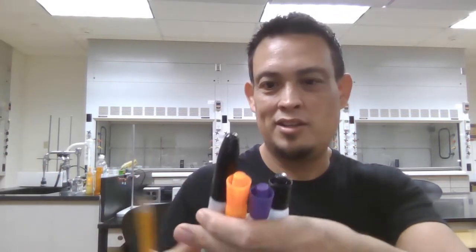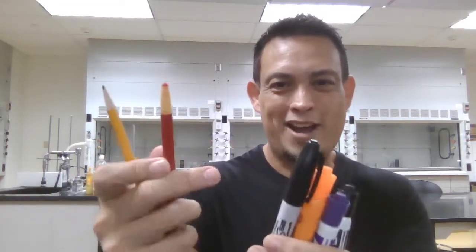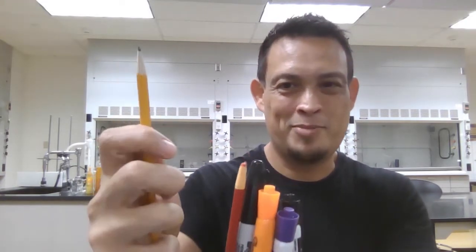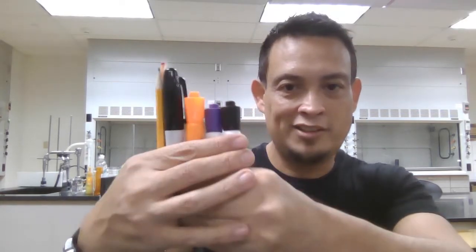So what I'm going to go ahead and do here is spot a TLC plate that I'll show you how to use a little bit later. But I want to mention that I have a few things I'm going to try to separate. I have a couple of dry erase markers, a black and a purple, and then I have this highlighter marker, a regular Sharpie, a wax pencil, and a regular pencil. And I'm going to run them with isopropyl alcohol. So we're going to see if we'll get any separations of pigments here today.